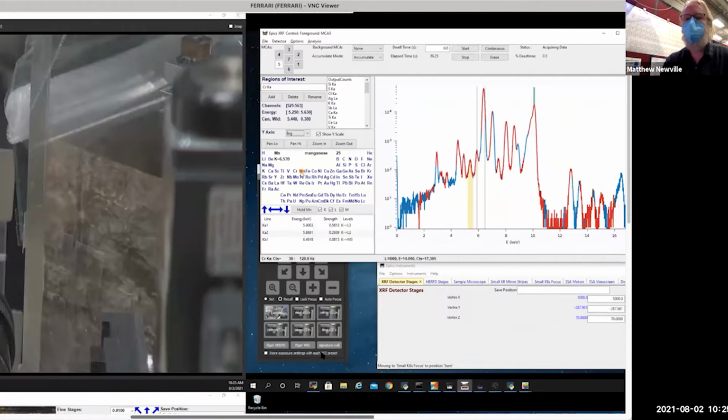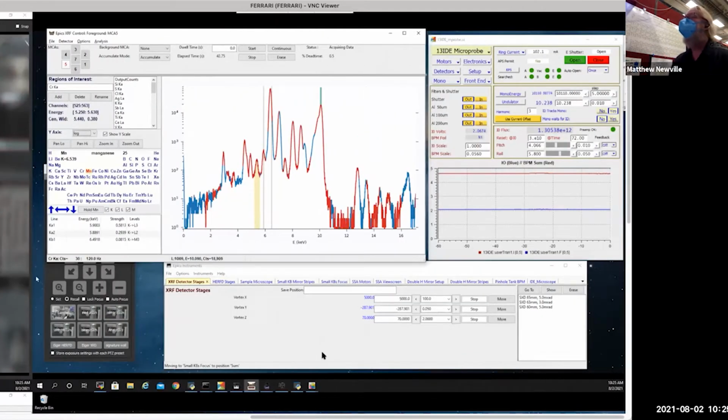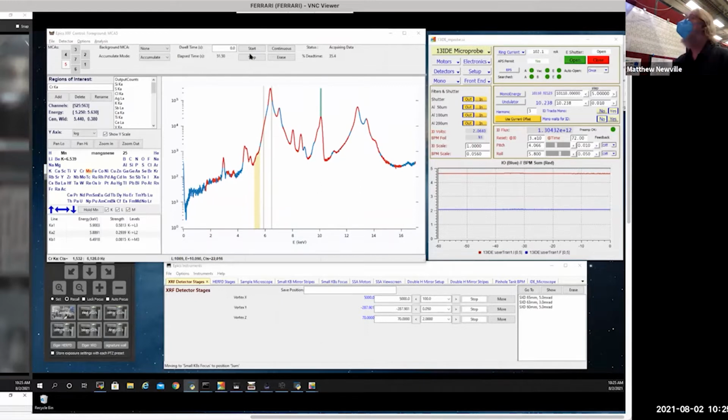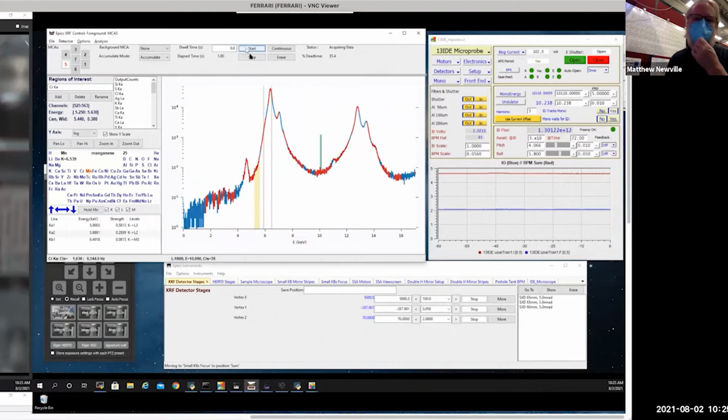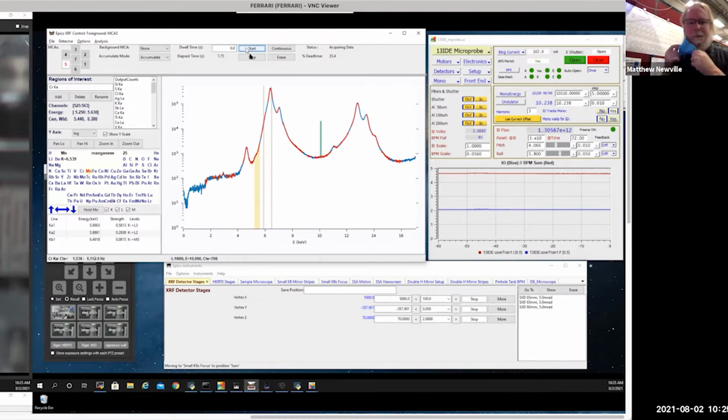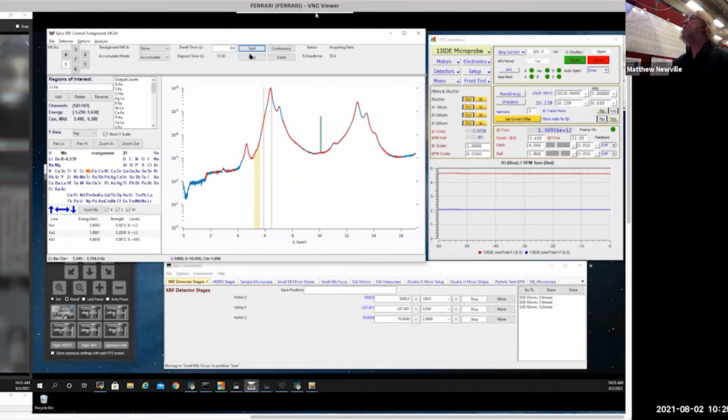We're going to go back to the iron foil position, and we're going to collect iron EXAFS. If I go to this, then the fluorescence spectra is totally saturated. We would not be able to measure this in fluorescence. Actually, we'll measure this foil in fluorescence and transmission, and we'll show how bad it is to measure this in fluorescence mode, and why you don't measure fluorescence on high concentration samples.